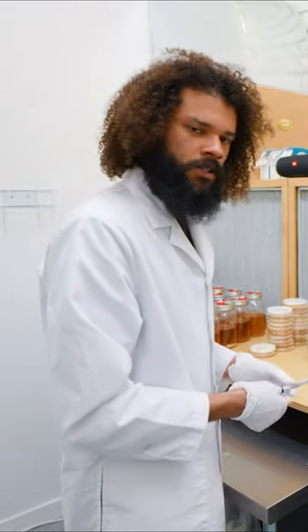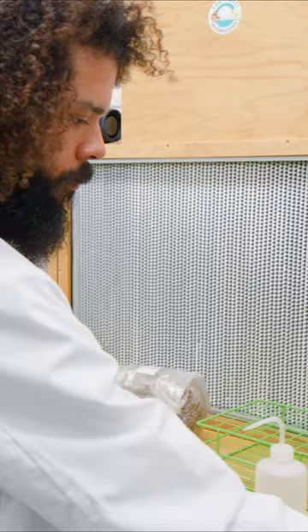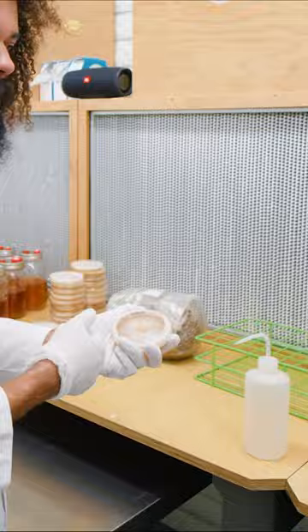We have some pre-sterilized bags of spawn, and we'll be taking some Petri plates and using that to create a bag of spawn. We'll heat our scalpel up again. This is a sorghum grain.